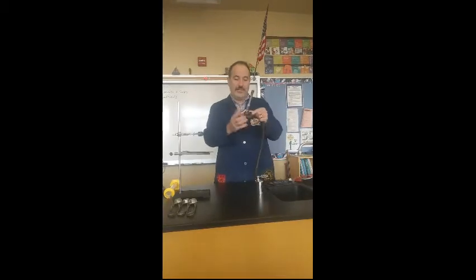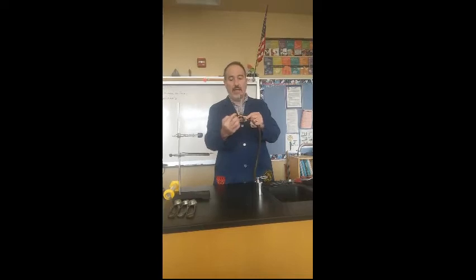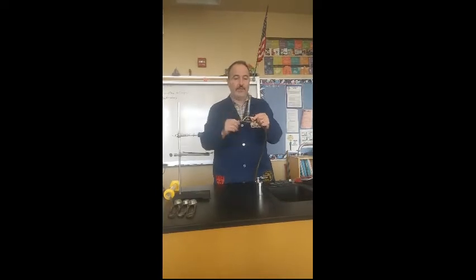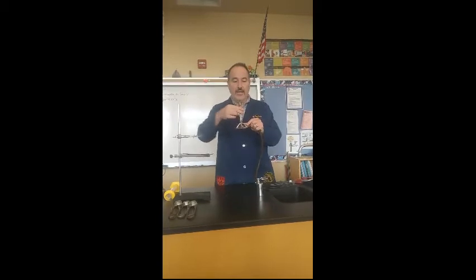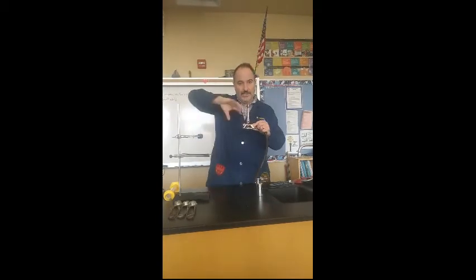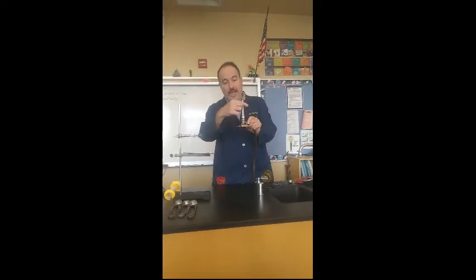Now the other adjustment is right here. This is the air vents, okay? And this allows the oxygen in. And you control the air vent by taking the entire barrel and twisting. If you twist it like a lid on a jar and close it, I don't know if you can see, but you can see now that there are threads visible and the window is smaller. And then if I keep going, it closes it more and more.